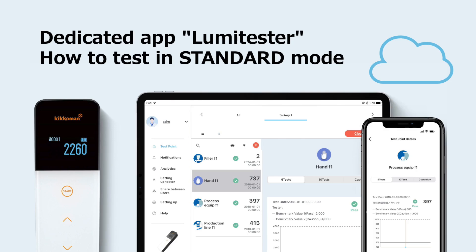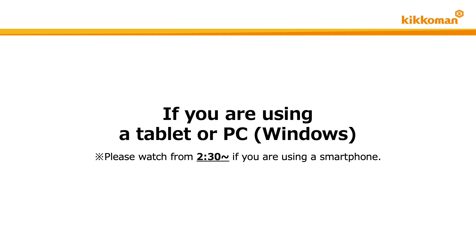In this video, we will explain how to test in standard mode. In the first half part of this video, we will explain the test method when you are using a PC or a tablet such as iPad. If you are using a smartphone, please see the second half part starting at 2:30.